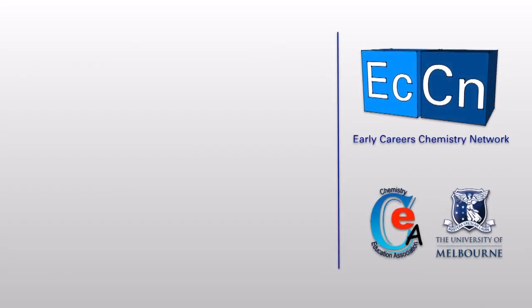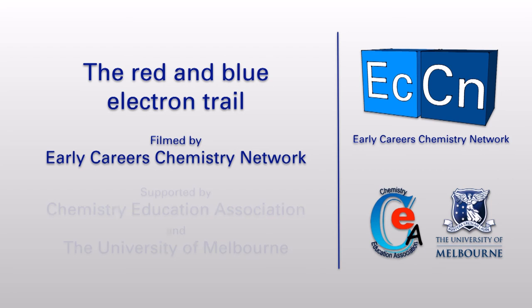A great demonstration to visually show oxidation-reduction reactions for your students.